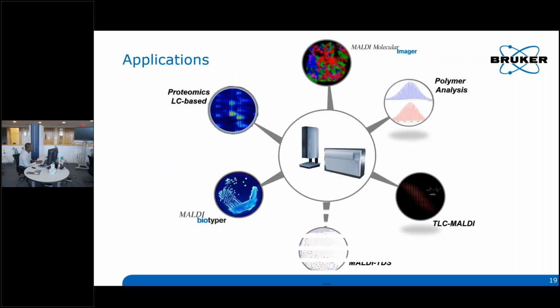Some of the other applications, aside from polymer analysis, in TLC MALDI, you can also use MALDI for top-down sequencing of proteins and peptides, for imaging experiments, as well as proteomics LC-based experiments, and MALDI Biotyper, which is also another line of instrument that we use for QA and QC applications.